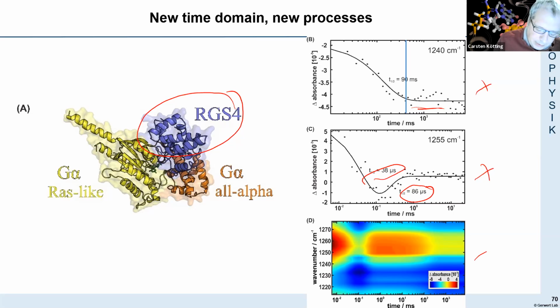So you can nicely get this 3D graph, where we see the complete spectral changes from 4 microseconds up to about 10 seconds, I think is the last data point. And this is done with one single sample of this protein.